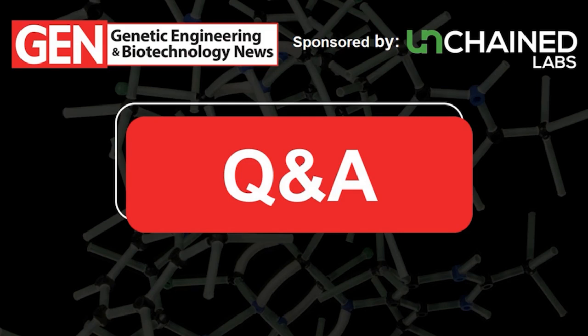And additionally, if you're going to do changes, you can use this instrument to show if there's an impact on that number. So I know what we're talking about here is how can we use it for percent full empty, but the bigger question is, how can we use this to show that we have control, that we have consistency in our manufacturing steps from step to step. So that's a value as well.